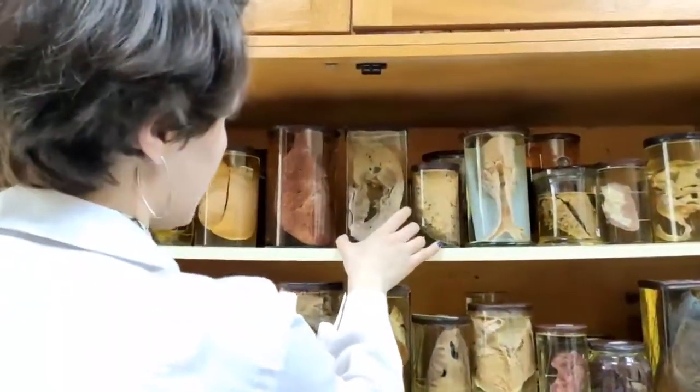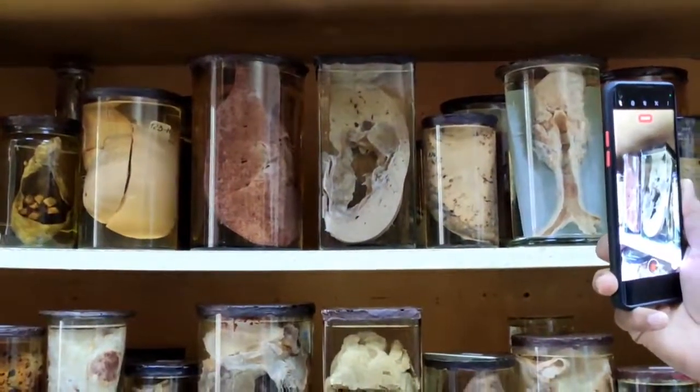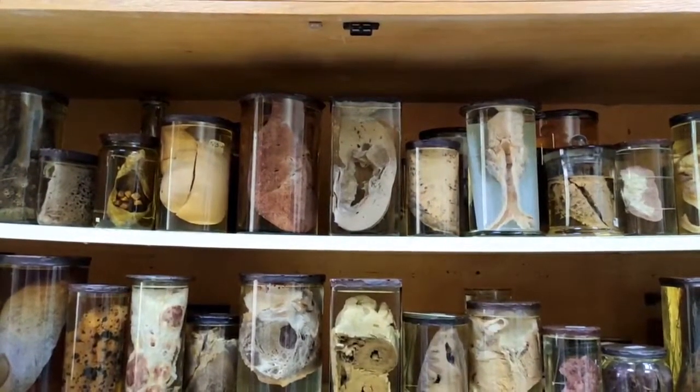The next specimen is Echinococcus of the liver. Echinococcus is what? Who remembers? Echinococcus is a parasite, Echinococcus multilocularis.